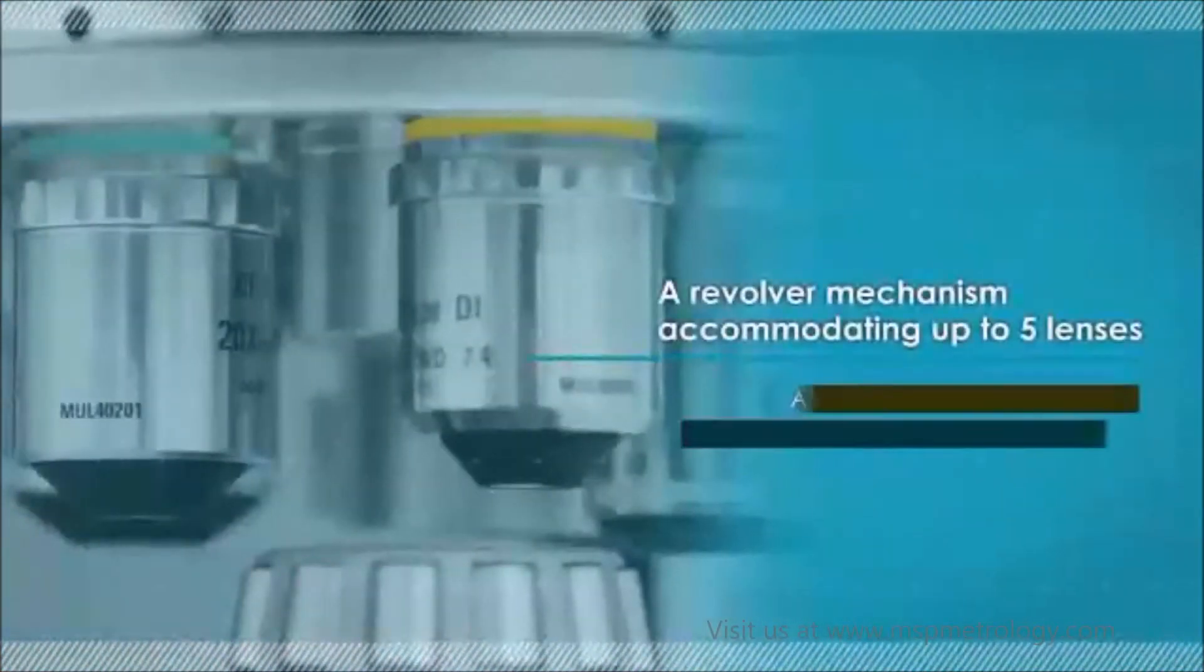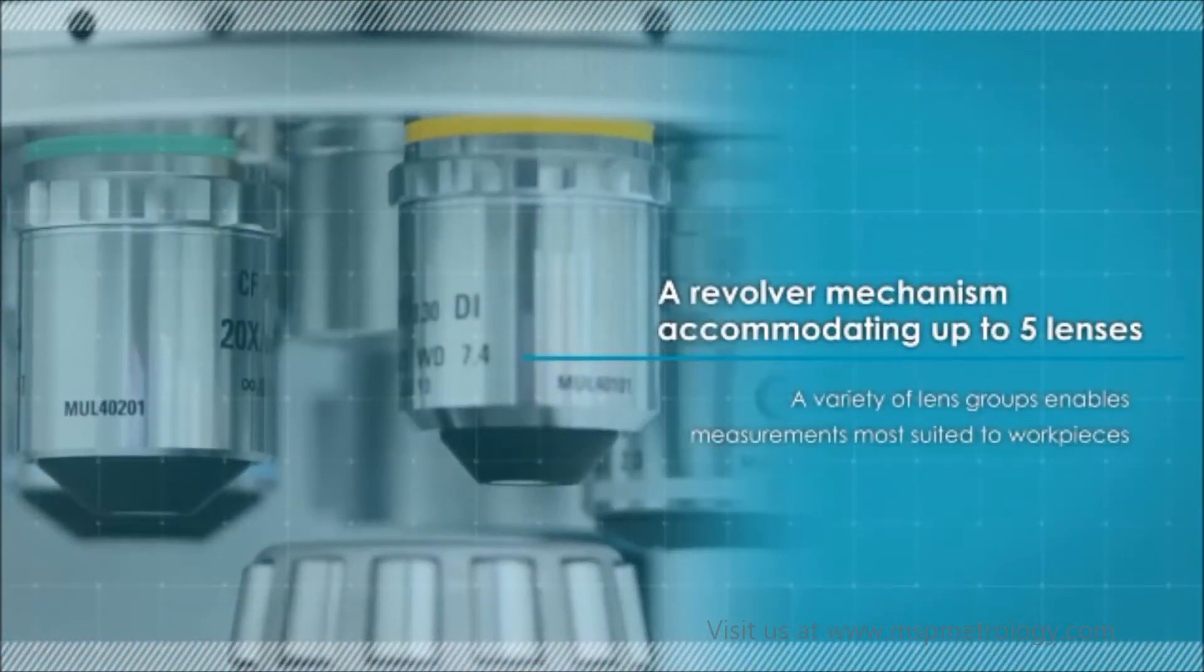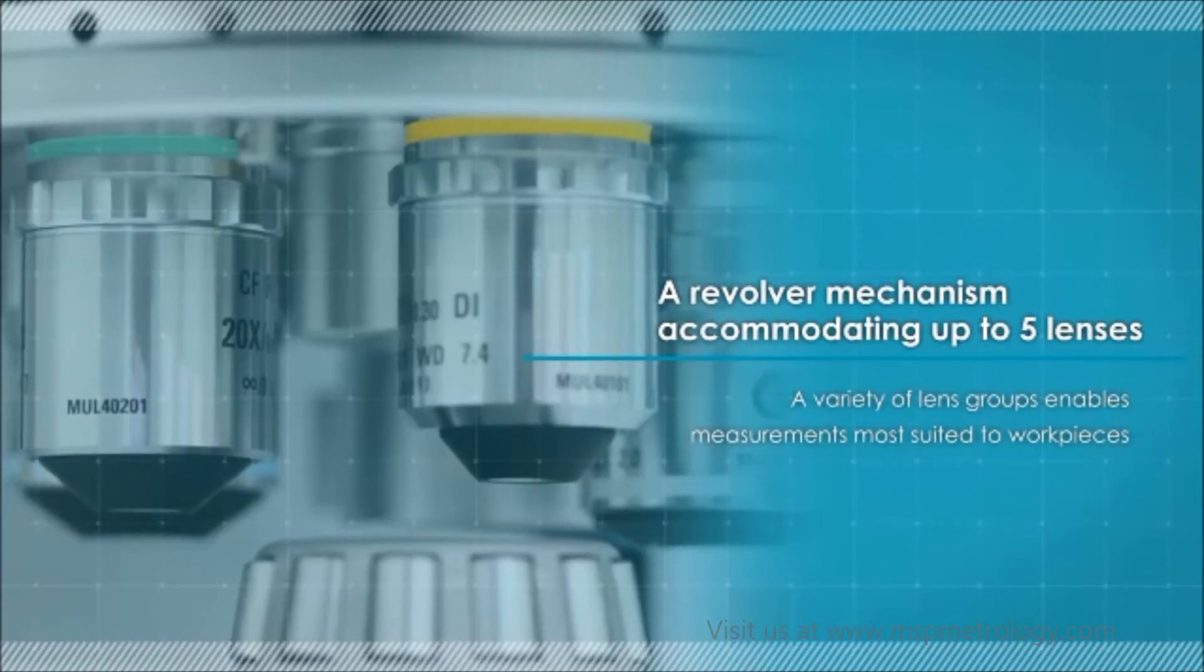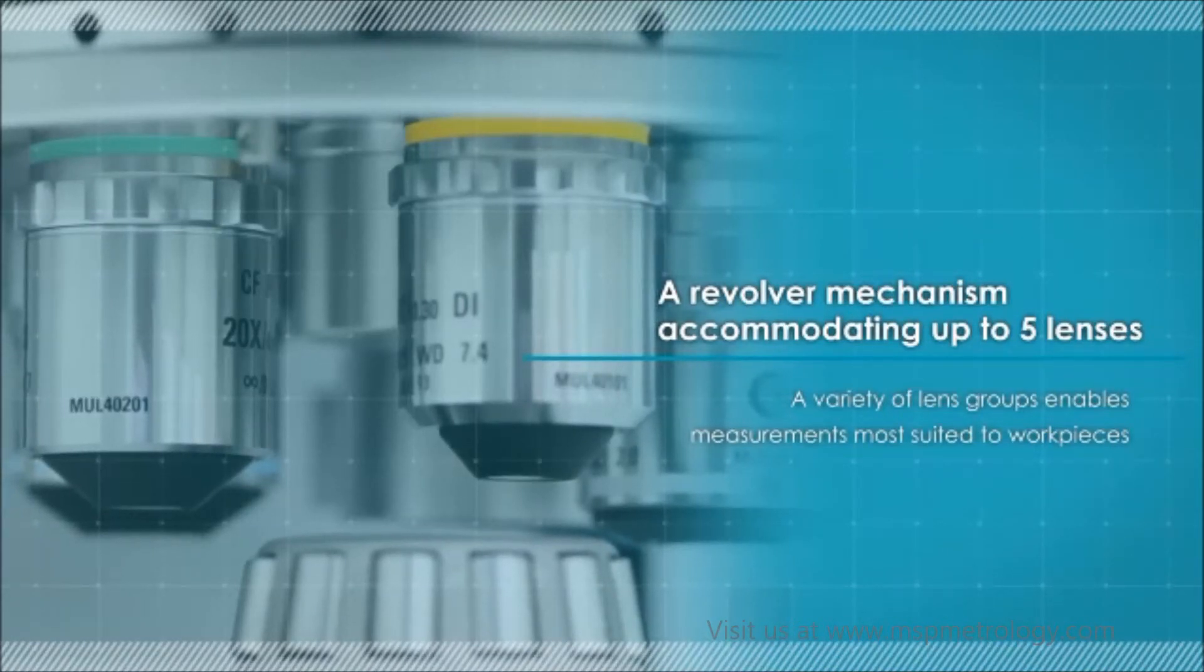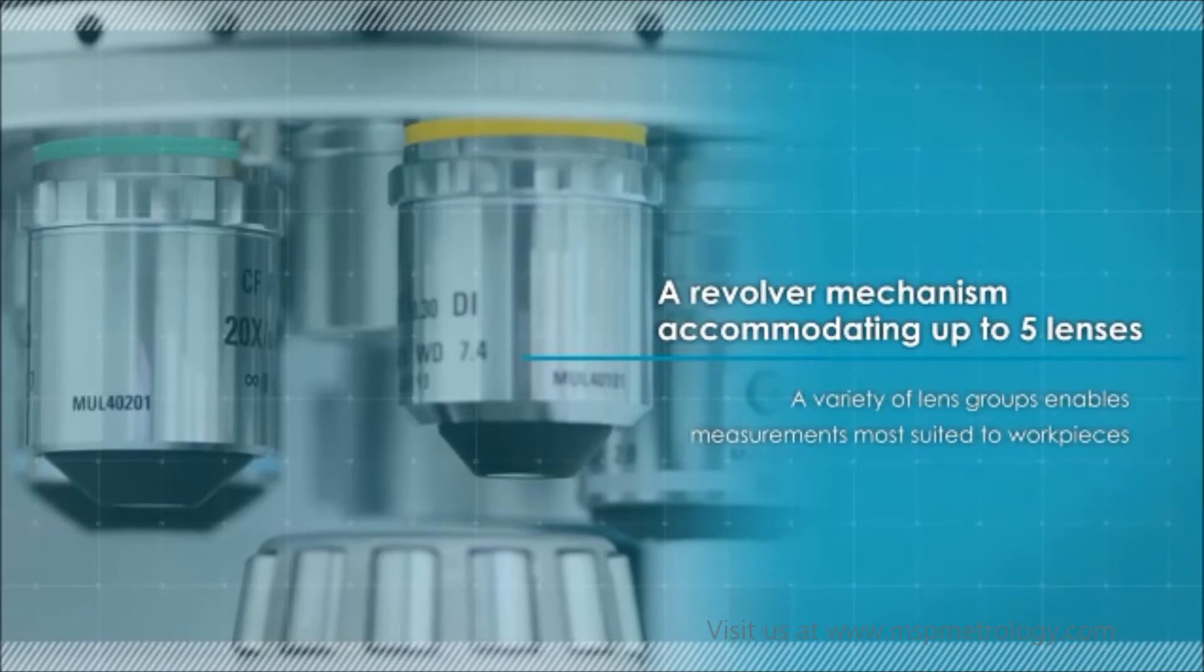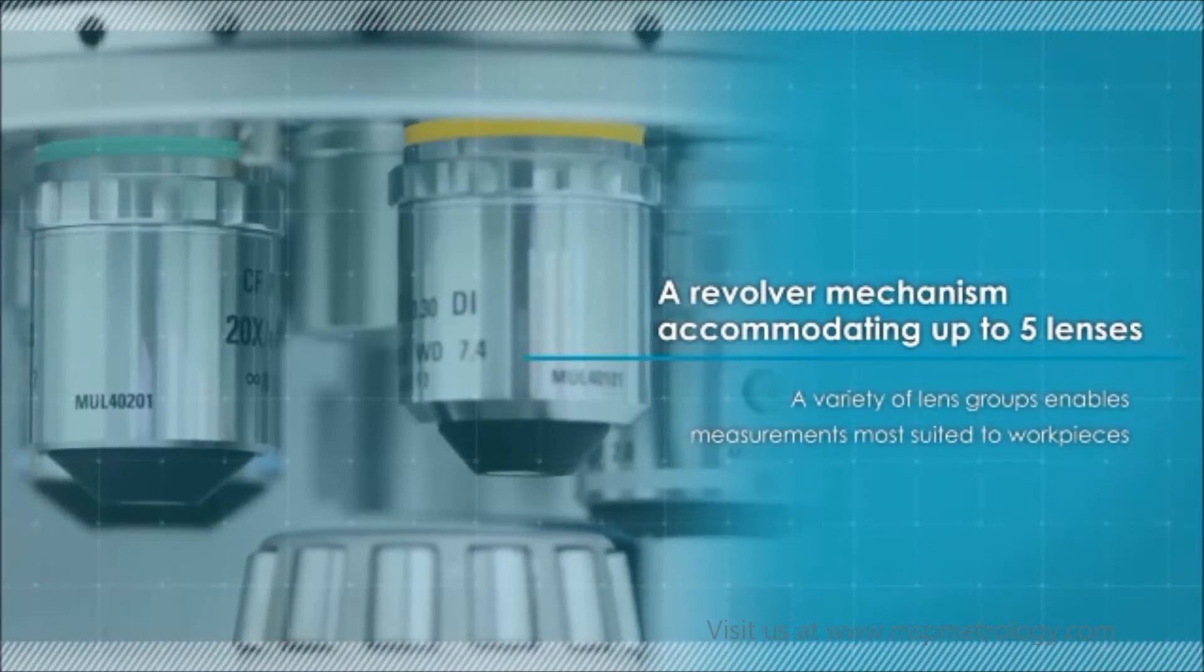The Optscope R now comes standard with a revolver mechanism which can hold up to five lenses. By combining different lens groups, customers can conduct measurements most suited to their workpiece.